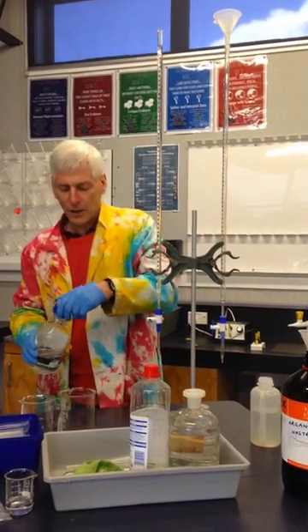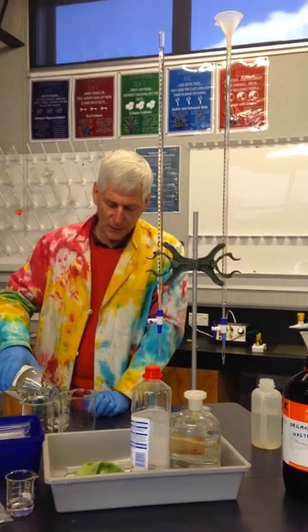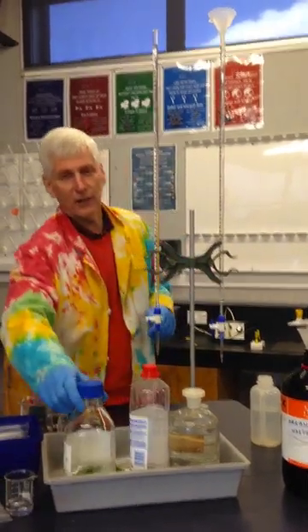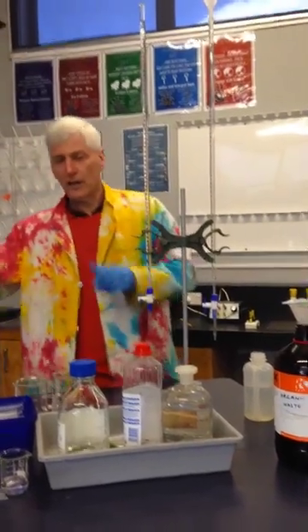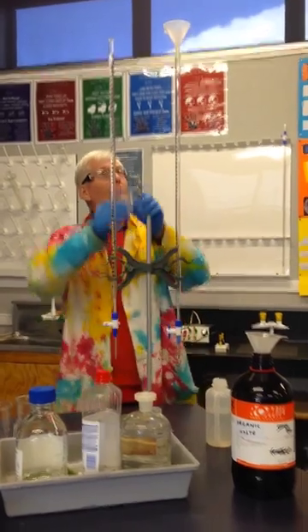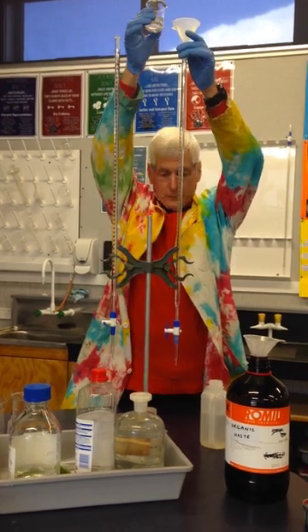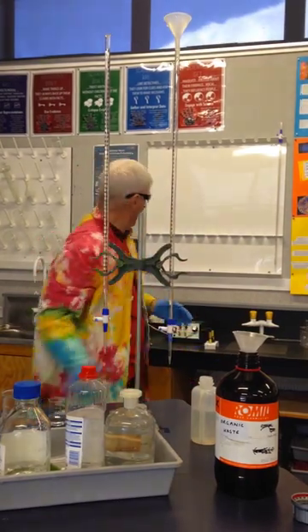Hexane is an organic molecule made of only carbon and hydrogen, and I want you to start thinking about what might cause the different responses that these two are going to have to electrostatic charges. Make sure the tap's closed first.